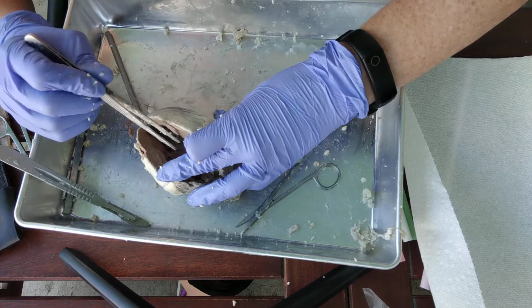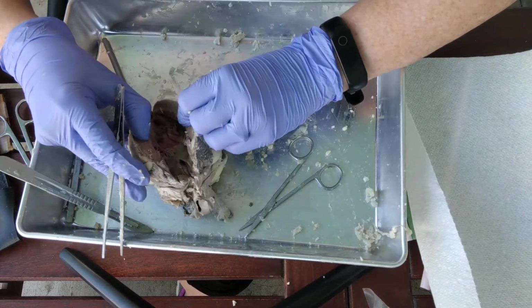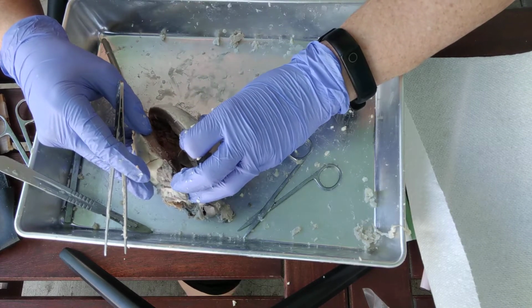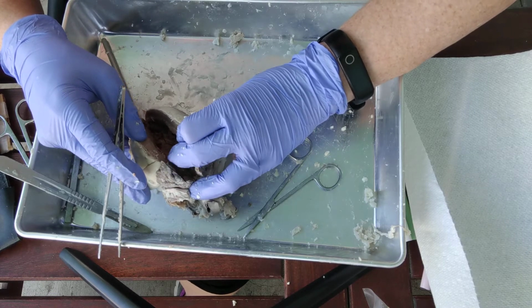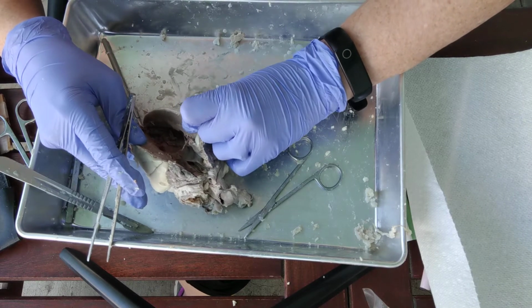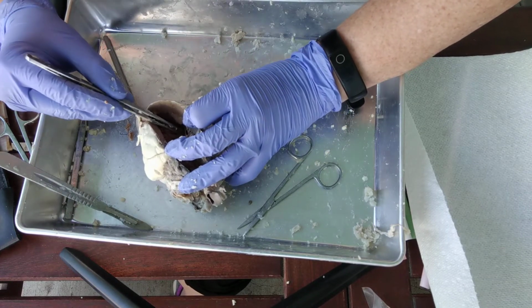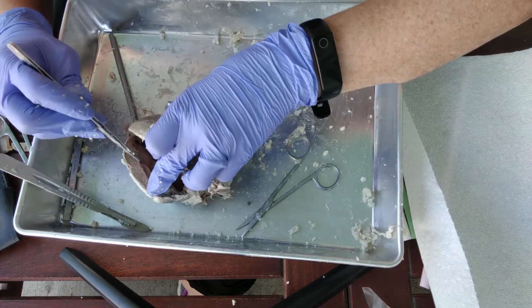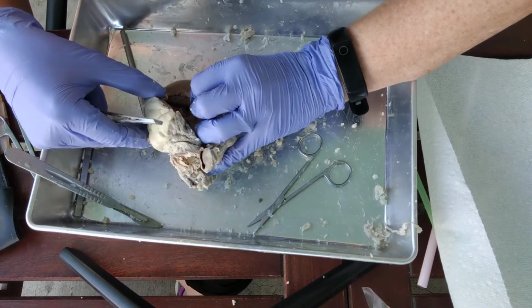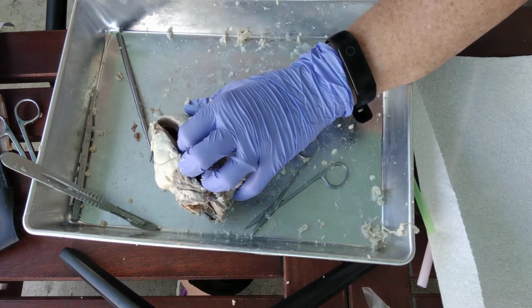Okay, so the bicuspid valve is going to have 2 cusps, 1, 2, but again, that's really tricky and hard to see. It really works much better to just orient yourself first, know what chamber you're in, and then know that the AV valve in the left ventricle is the bicuspid valve. Okay, that's the bicuspid valve. Okay, so again, same thing. These are the cusps, the strings are the chordae tendineae, the mound of muscle is the papillary muscle, the texture on the sides of the walls is the trabeculae carneae, and the endocardium.